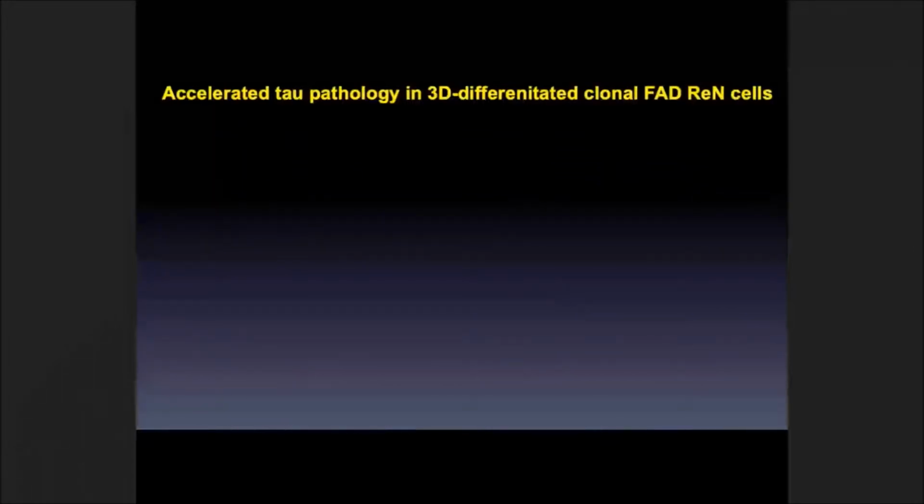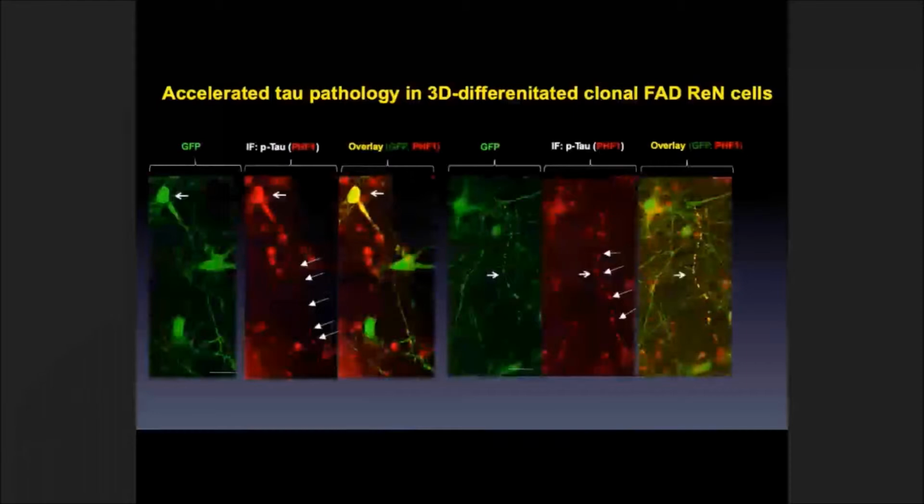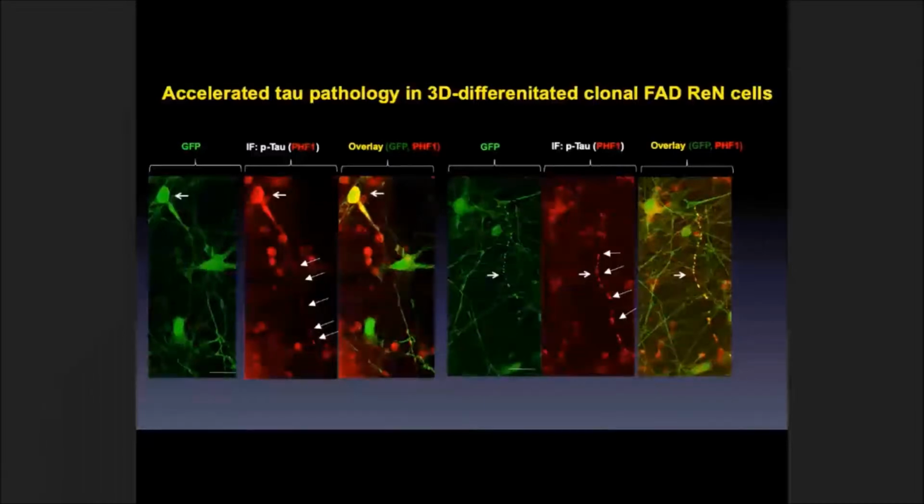So this is a little better resolution, pseudo color. Again, this is pathogenic tau web. And you can see certain cells have accumulated pathogenic tau. And one thing we also found is that most pathogenic tau accumulation leads to these dystrophic neurites. You can see the neurites are unusual.